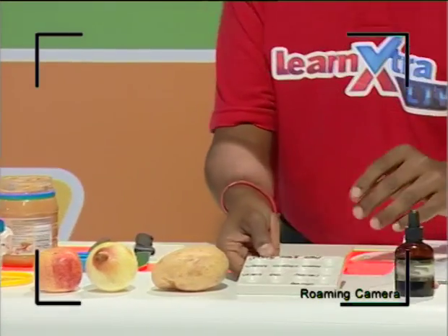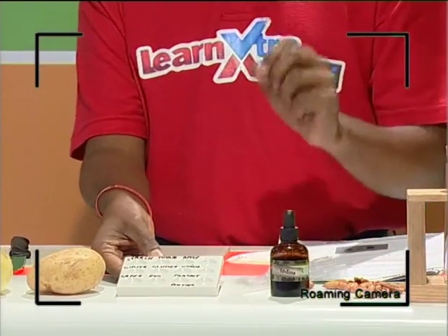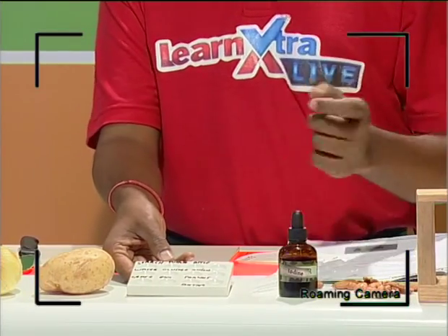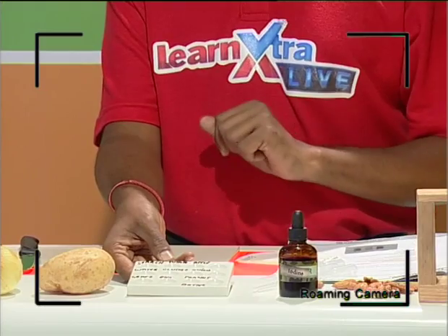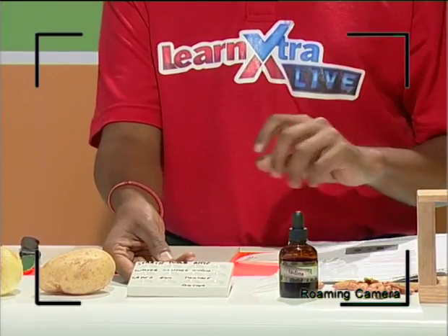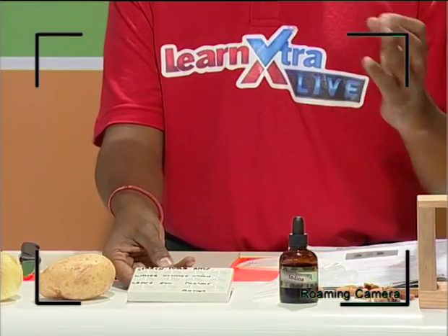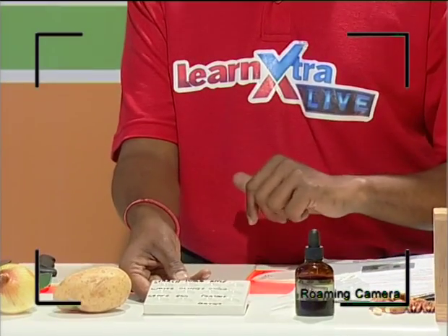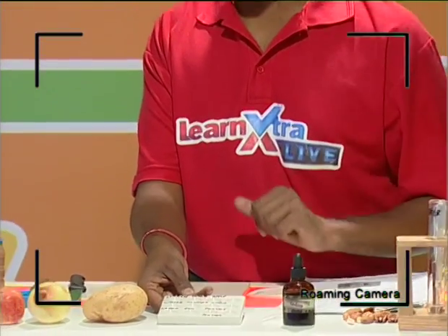Okay, so on this tile, this is called a spotting tile. And again, this is a very simple experiment, guys. You could do it. All you need is a dropper and a bottle of iodine, and you're going to test your different samples. Iodine is a bit corrosive, but as soon as it gets onto your fingers, you rinse your hands, and everything should be fine. If you do have a problem and it persists, then make sure you go and see a medical specialist or somebody who can advise you accordingly.